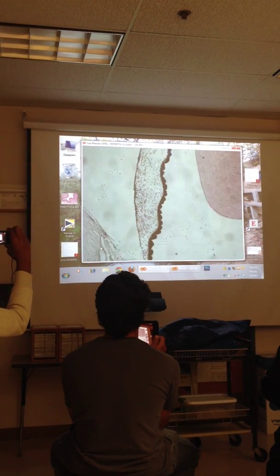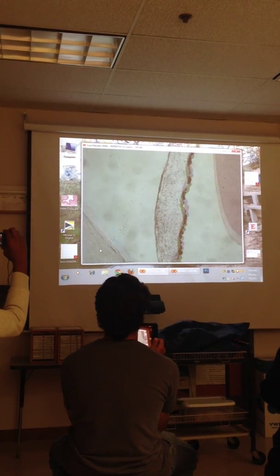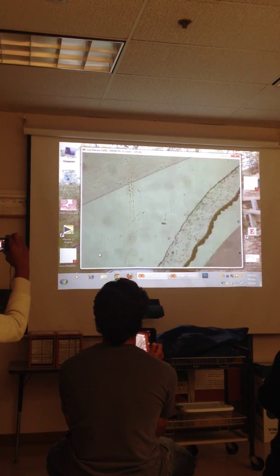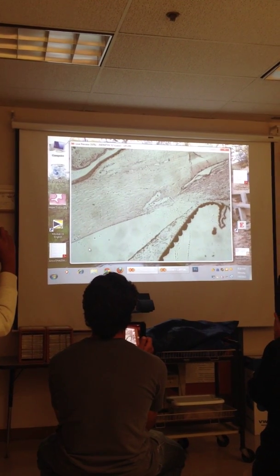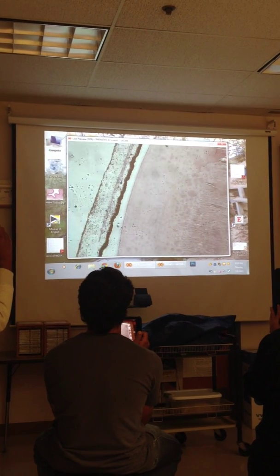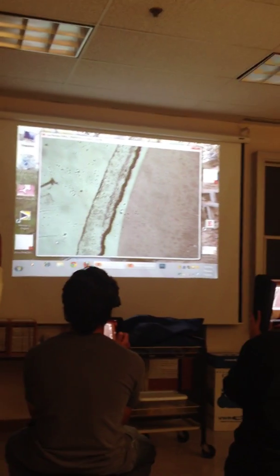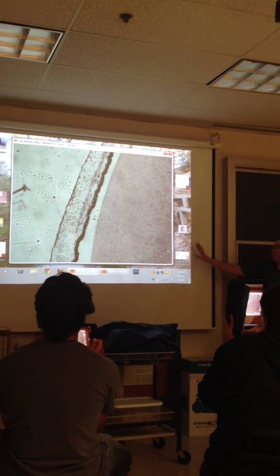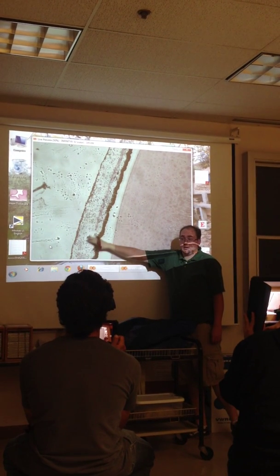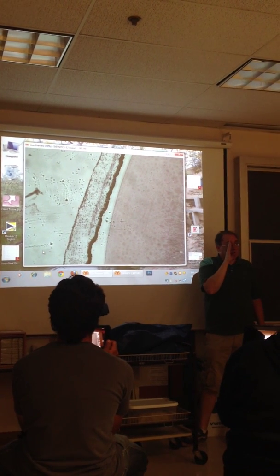You see that's still the cornea out here. We go right behind that. We have this area, which is going to look like, we've cut to the side of the eye here, so you're not seeing the pupil in this structure, but you can see it's covering what's behind it there. So you have the lens back here that I'll show you more of in a second, and this is the iris here. The reason you don't see the pupil, obviously, is that the dissection's over from the side, right?